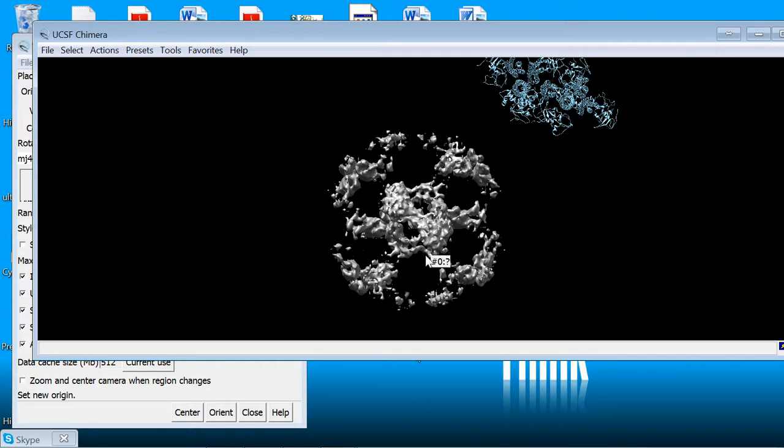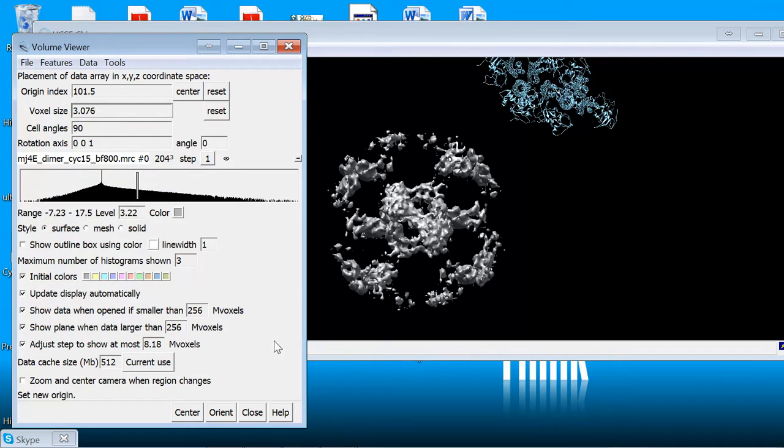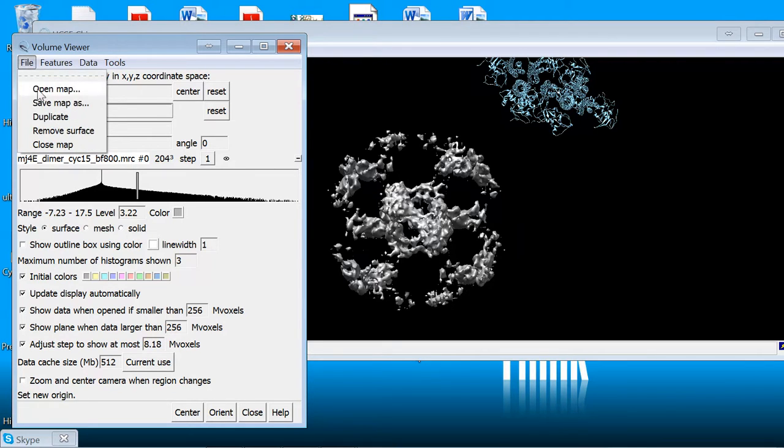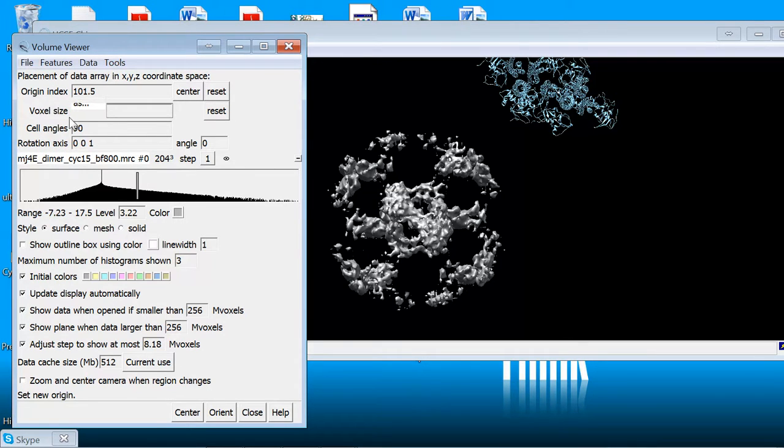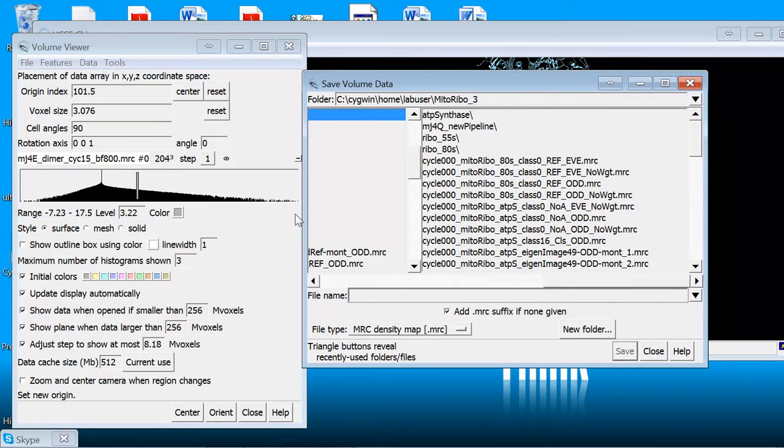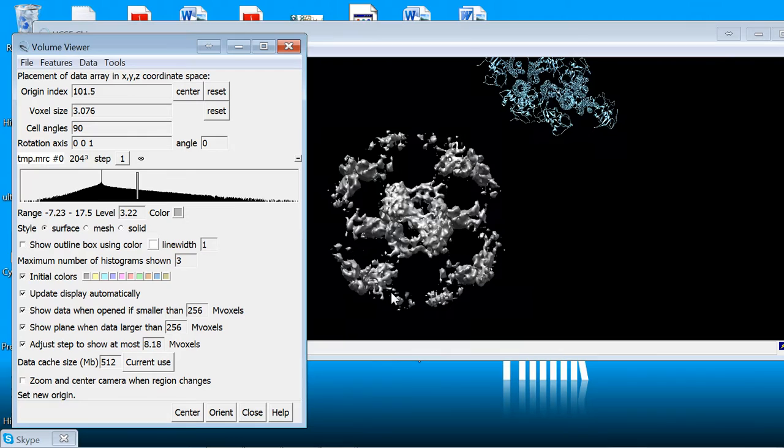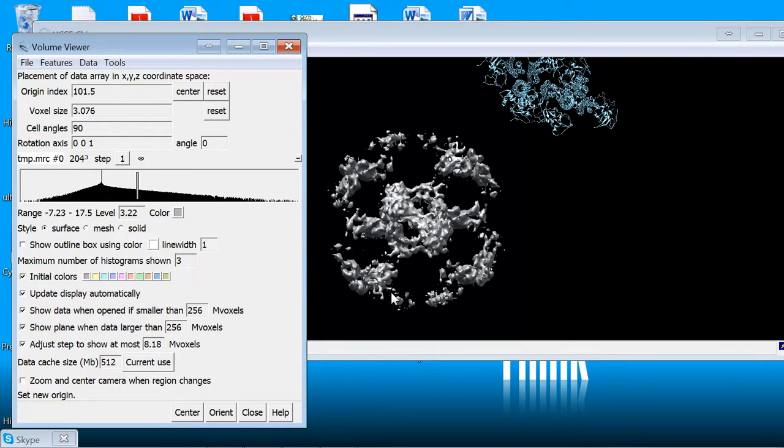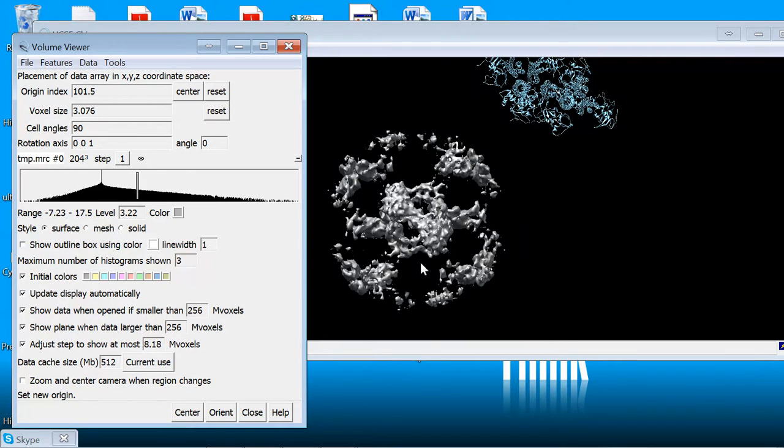And once you've done that, since you've changed the header and you've changed the pixel size it's good to save the map. So I'll save it as and put it under a different name. In this case I'm just going to save it as temp.mrc in whatever folder I'm working in. And that's the map that we're going to use then in the future.